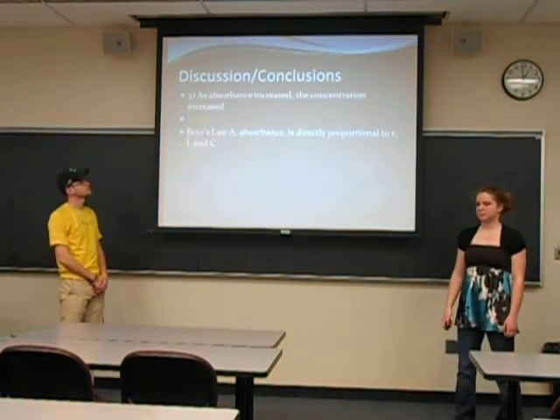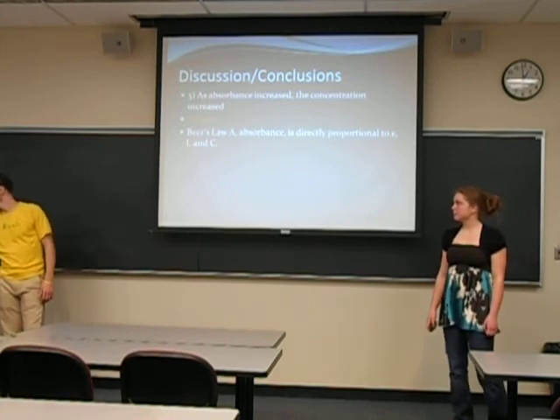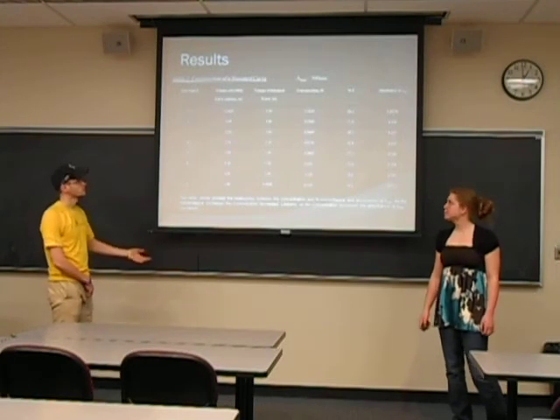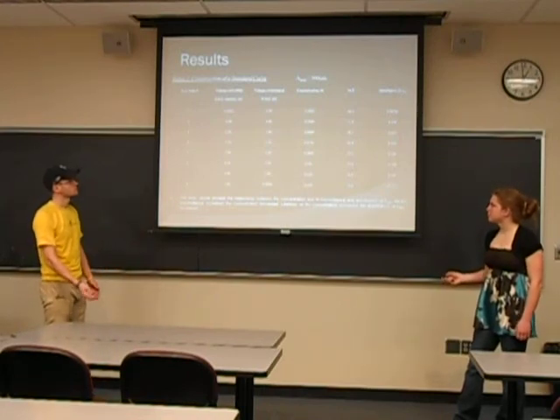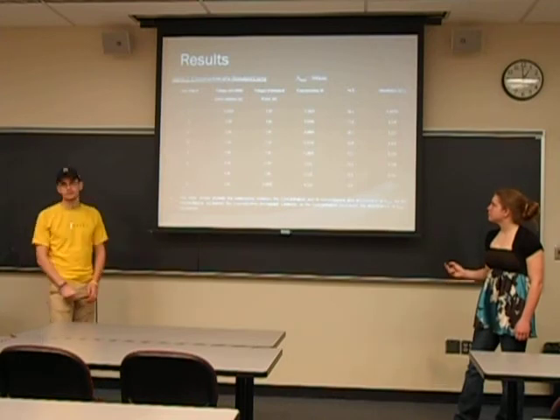As concentration increased, absorbance also increased. We can see in table 2 that as concentration increased, absorbance also increased at lambda max. And you can say it in the same way that as your concentration increased, the percent transmittance decreased.